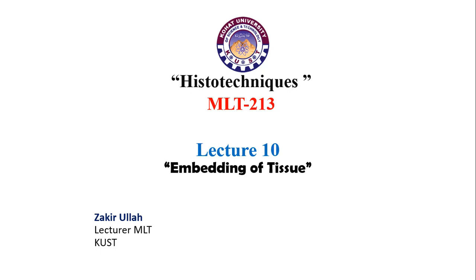Welcome to lecture 10 of histotechnics. This lecture is about the next step after tissue processing, that is the embedding of the tissues in molten paraffin wax.